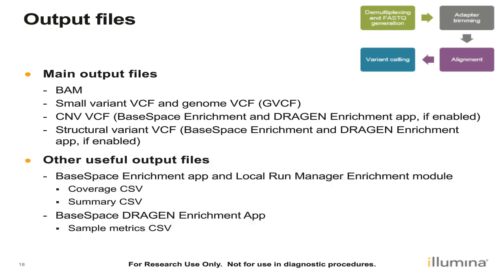And then some of the other useful output files we'll go into. These are things like the coverage and summary and sample metrics files produced by the respective applications. And we'll go into those a little bit and how they can help with troubleshooting.